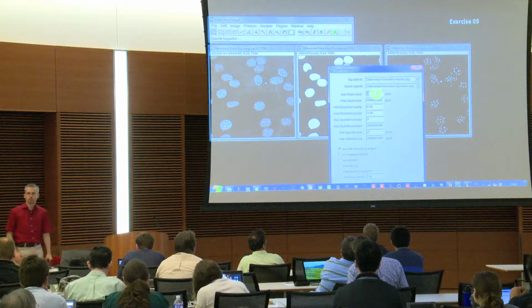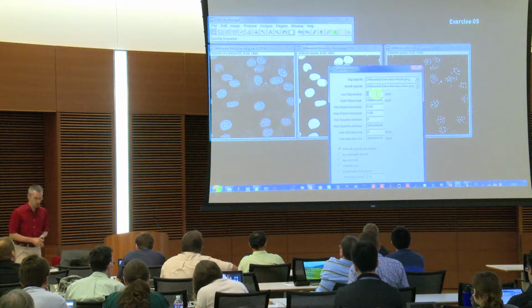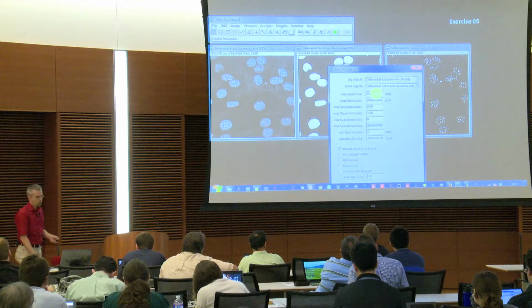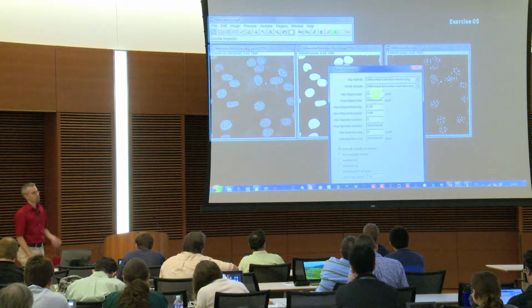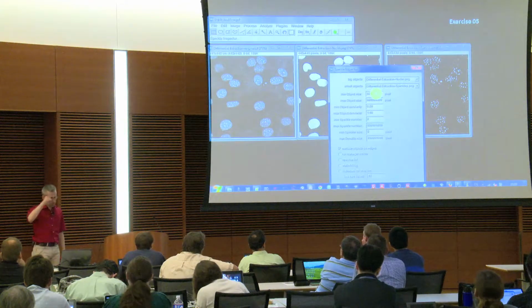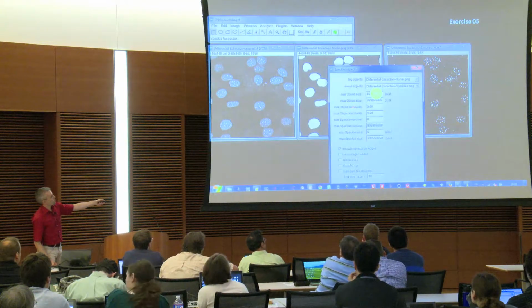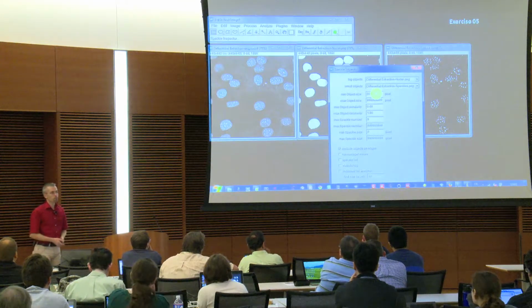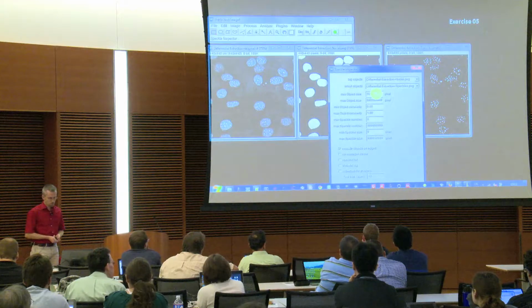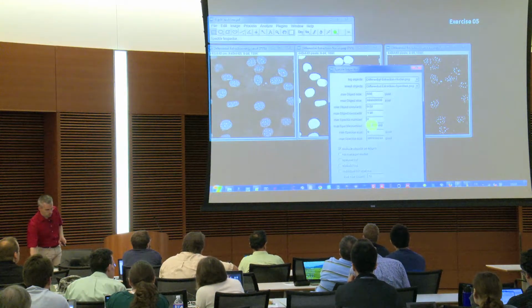So the object size is exactly what I've keyed in for the analyzed particles beforehand. 500 was my minimum cutoff, and I have no maximum cutoff size, so I keep that here at 999. One day, if I have time, I'll change that to infinity. Object circularity, as beforehand, we don't use that here. And to this function, we come directly after the first trial.